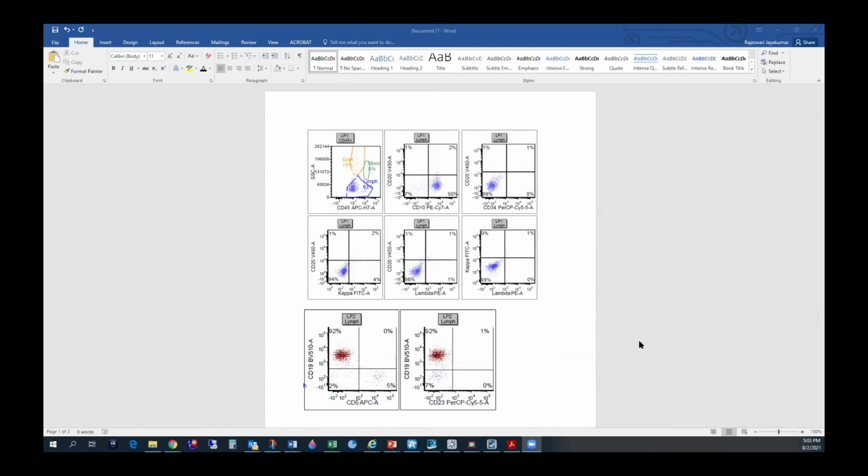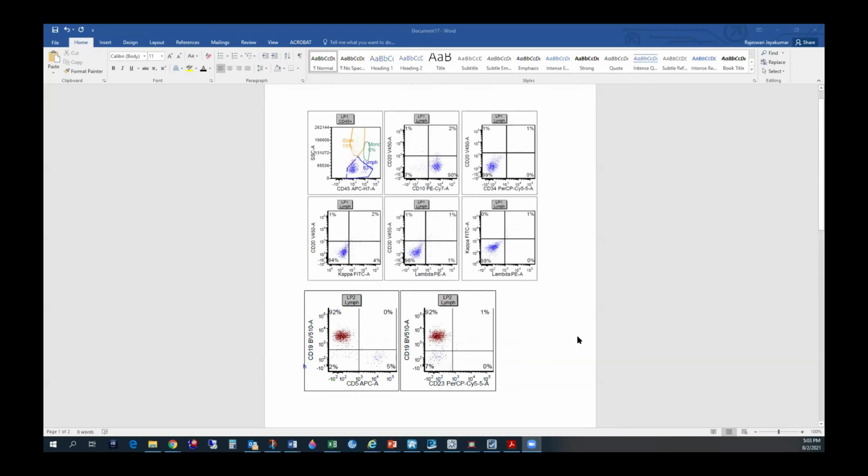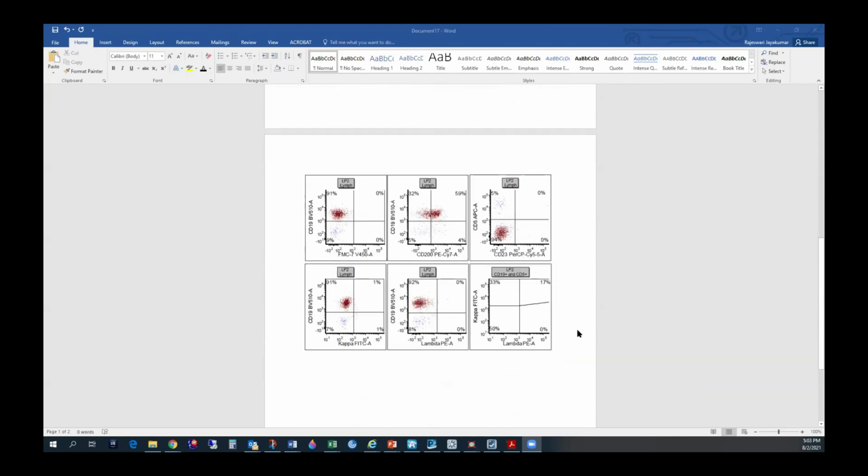So here's the thing: the patient did not receive rituximab in the last 2 years. I would want to see the other markers as well, the abnormal myeloids. And I mean, this is really, I should not actually, this will not be fair.